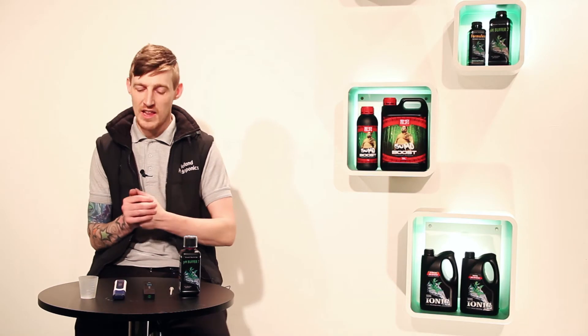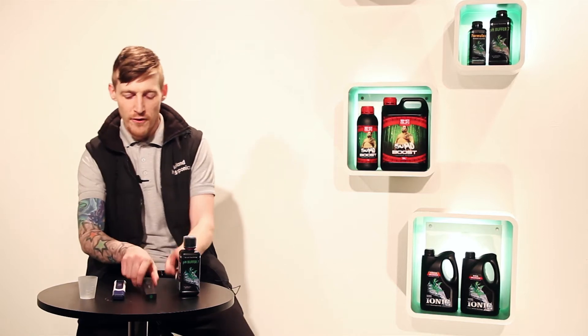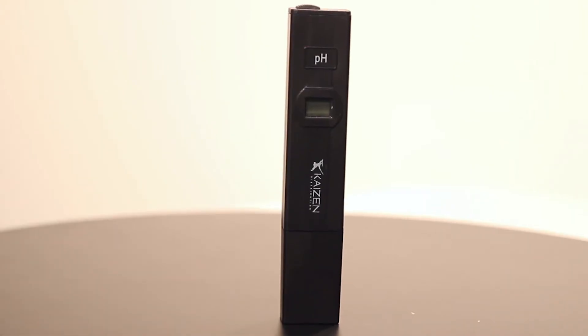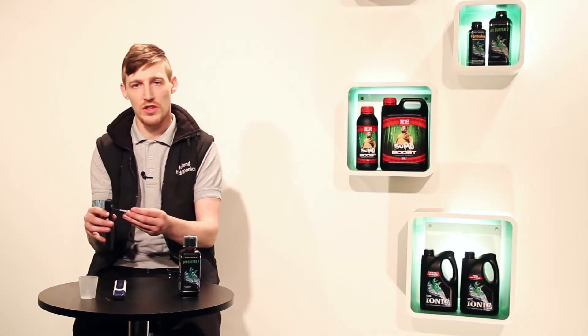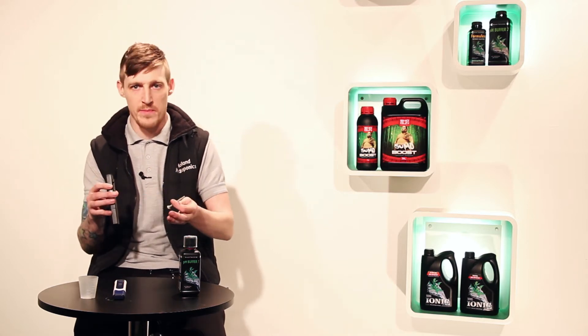Before we actually move on to calibrating the pH pens, I'm just going to show you a few subtle differences between a few pens on the market that you can get these days. The first one is what we like to class as a budget pH pen. This comes with a little screwdriver that just pops into the back — you put it in your solution, you screw it up or down to the right number, and that's it, your pH pen is calibrated.